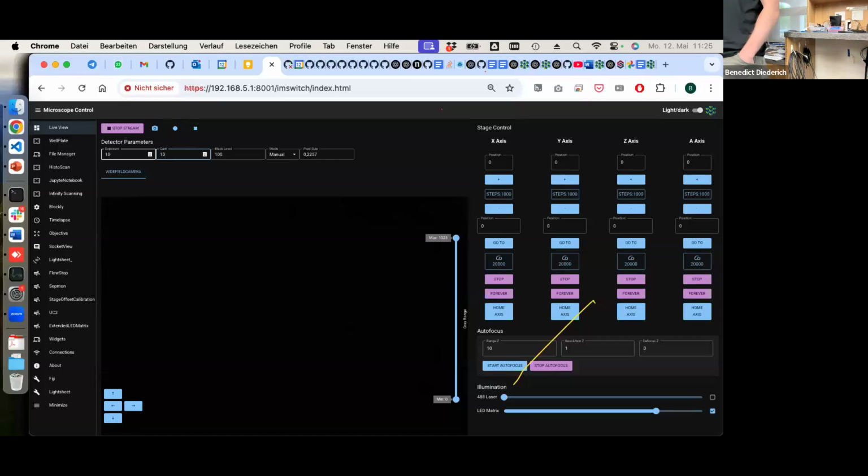How do fine adjustments work? Are they needed? For the sample motion, there's the state, and for others, you'll see that later. In there, you can move it precisely. You could put this away here. My magic glue.